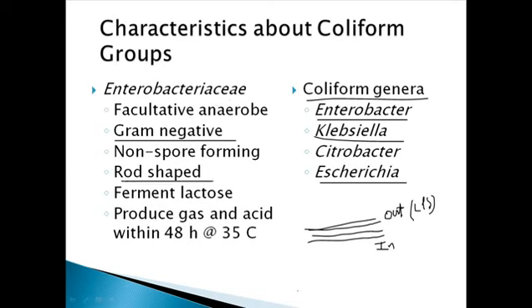They are normally rod shaped. For example, as we know the E. coli structure like this, they are rod shaped. They can ferment lactose. That's a very important property, the biochemical property of them. They can ferment lactose, and as they can ferment lactose, we use this feature of them against some different biochemical tests to figure out whether the presence of coliform in a water is there or not. So we use lactose medium there, and we add different water samples to them.